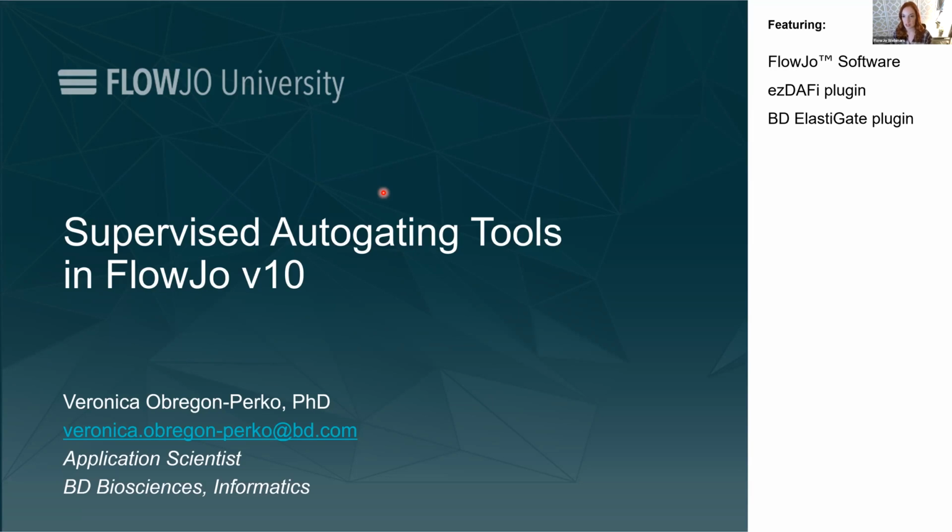I'll open with some slides just to set the stage for the topics we'll be talking about. And then I'll spend the rest of the time in the software quickly demoing what these tools look like, where you can access them, and how you can install them.